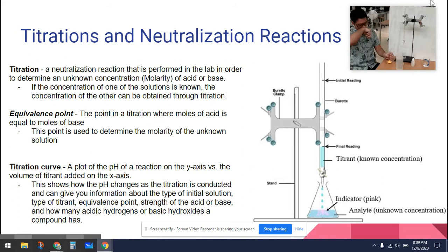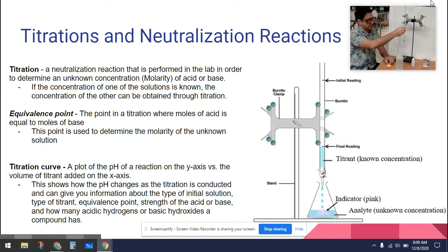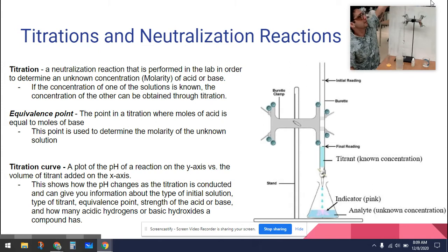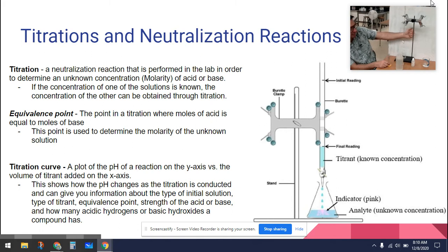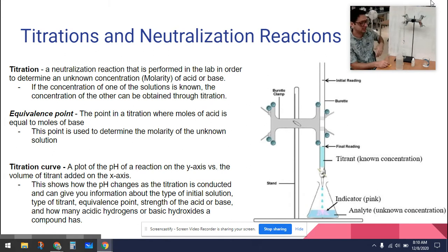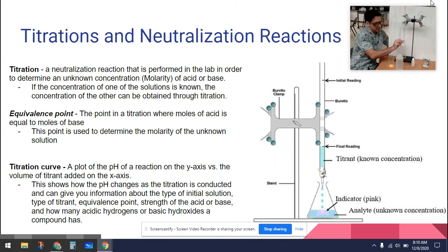You could measure the volume with a graduated cylinder or with a burette. This is called a burette. On the top of it I have a funnel so that I can pour the other solution in. There's also a burette clamp and a ring stand — the ring stand holds everything up and the burette clamp holds the burette. There's a little lever: when it's parallel it releases whatever's in here.